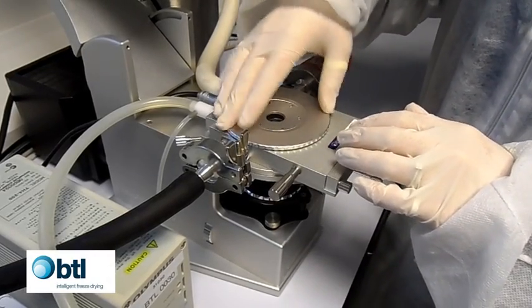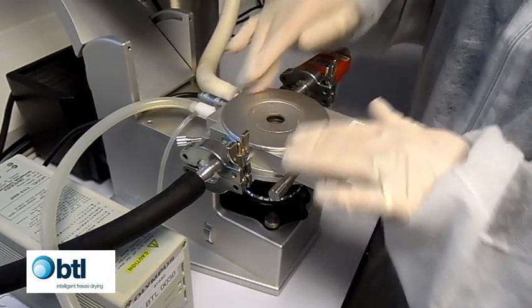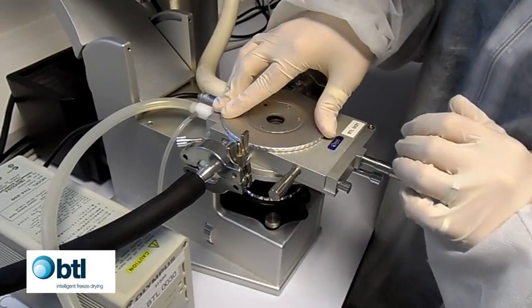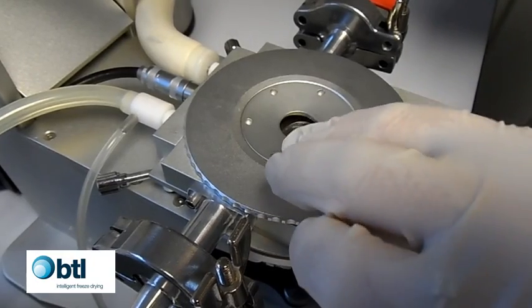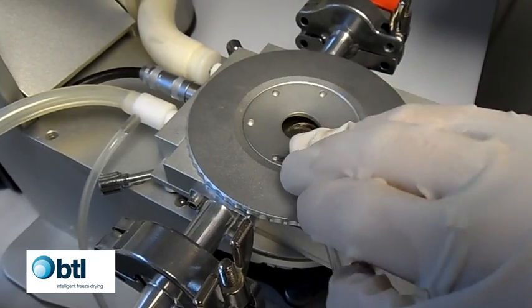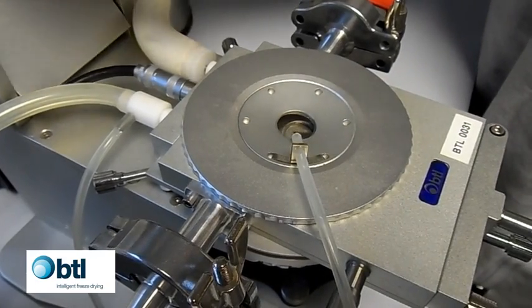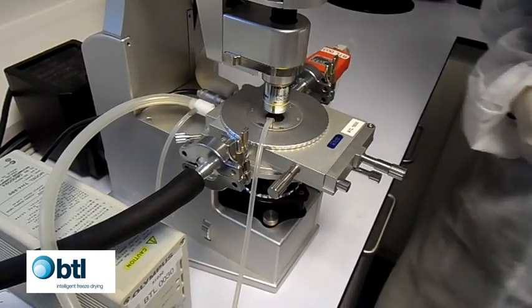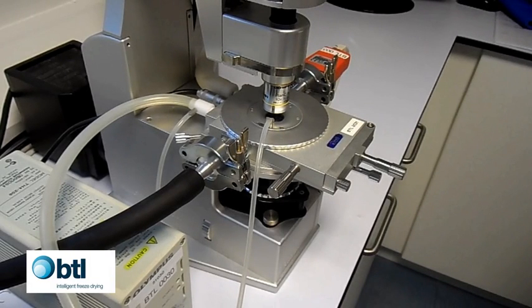Screw the lid back on, and clip on the tube so that recycled nitrogen gas can be used to prevent condensation forming on the lid during analysis. Replace the imaging station arm. Your Lyostat is now loaded and ready for use.